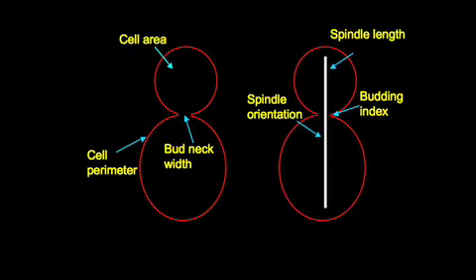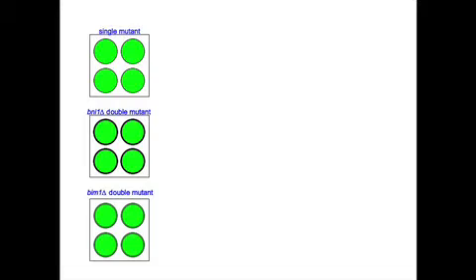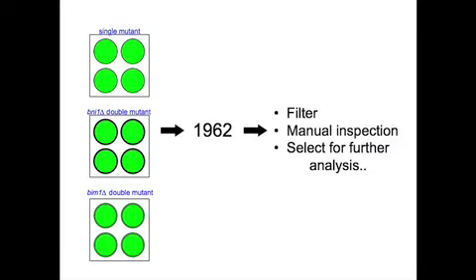Every single image that we take, there's a couple hundred objects in there, so you're getting a couple of hundred data points for every single image that you take. So getting decent statistics is fairly straightforward. By setting a p-value cutoff of 0.1, the group identified almost 2,000 mutants with at least one of the 3 spindle defects amongst the 3 screens. The group then whittled this number down to 182 mutants for further analysis.